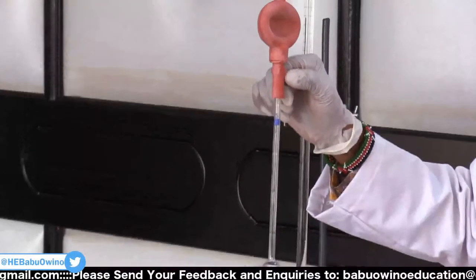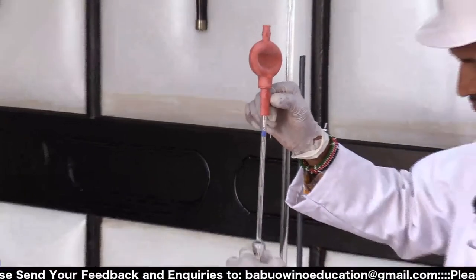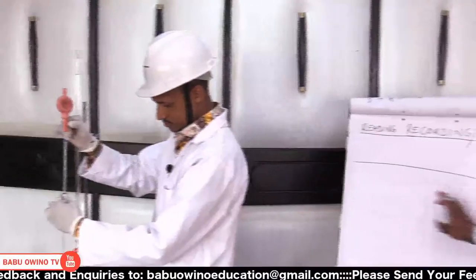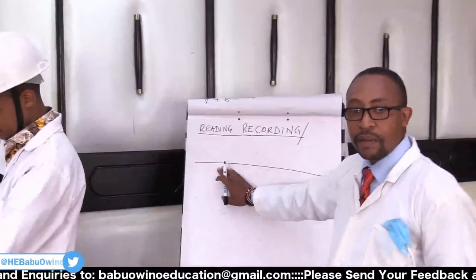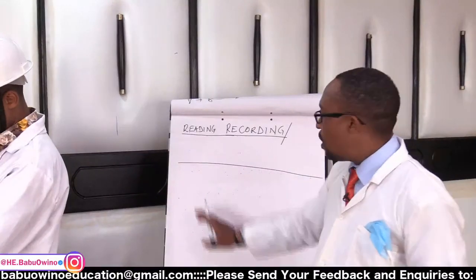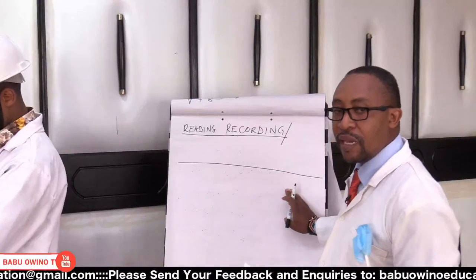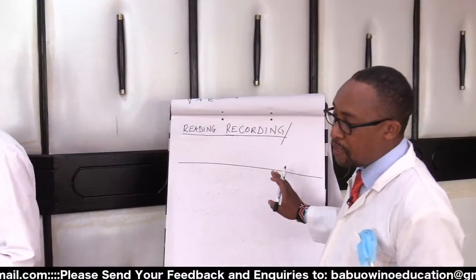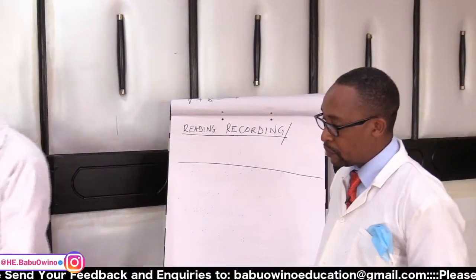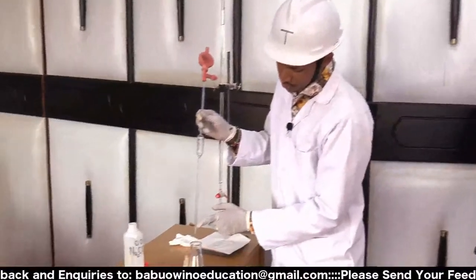Why did we choose methyl orange in this case? A strong acid. And a strong acid, we can use any indicator. I say that again. A strong acid reacted with a strong base, any indicator would work. But a strong acid with a weak base, we use methyl orange. It is the most appropriate indicator.